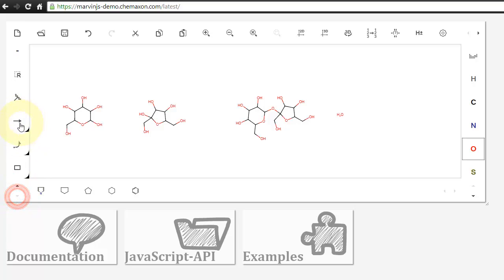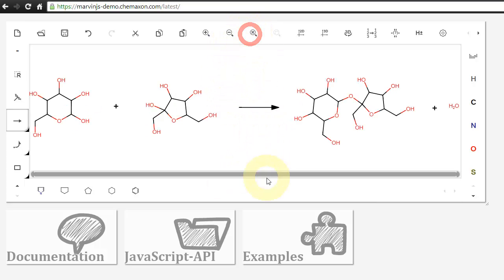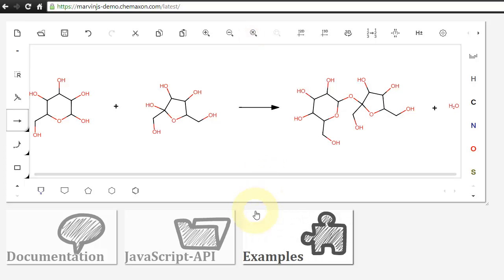From there, all I need to do is then just scroll down a little bit on the left side to the arrow, and here I can go ahead and single clicks will do pluses, and then click and drags will do arrows. Now that that's all done, I can just click on the zoom to fit, so zoom all, and then there we have it. Everything is all close up.